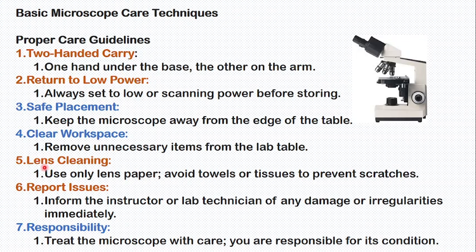You should remember to clean the lens. Clean the lens only using lens paper. Don't use your gloves, please. There is lens paper which is specifically for microscopes. Avoid towels or tissue to prevent scratches. Now another thing you should remember: once your microscope is not working properly and has a problem, automatically report the issue.